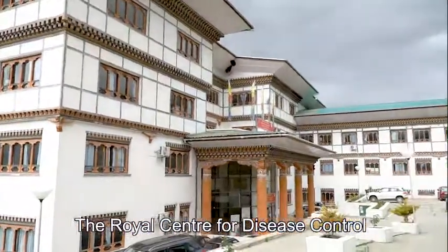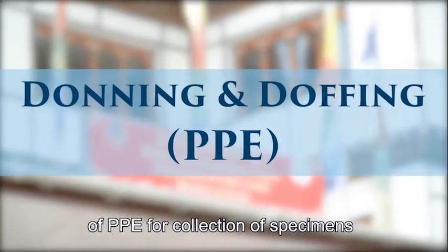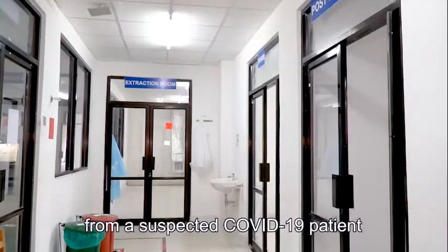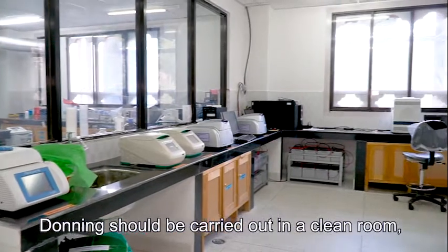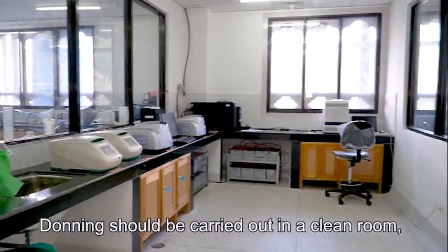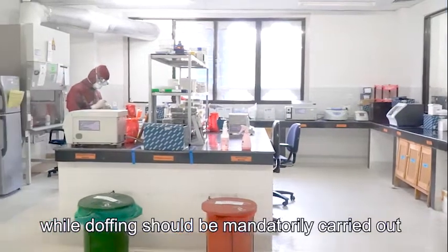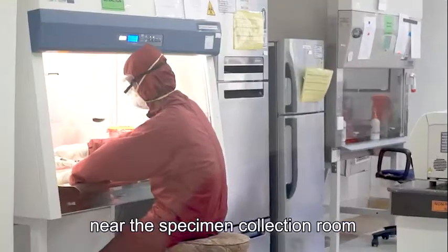The Royal Centre for Disease Control would like to present to you the procedures for donning and doffing of personal protective equipment for collection of specimens from a suspected COVID-19 patient. Donning should be carried out in a clean room, preferably near the specimen collection room, while doffing should be mandatorily carried out near the specimen collection room.